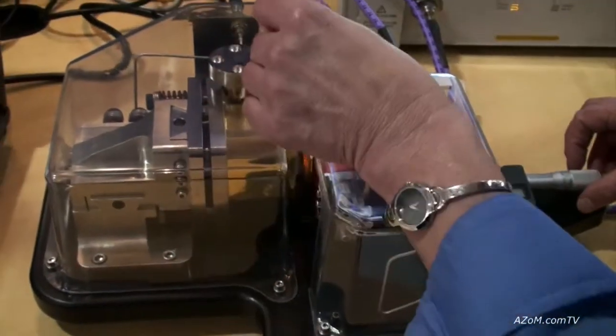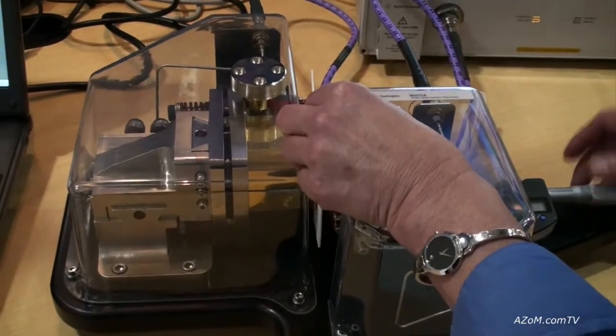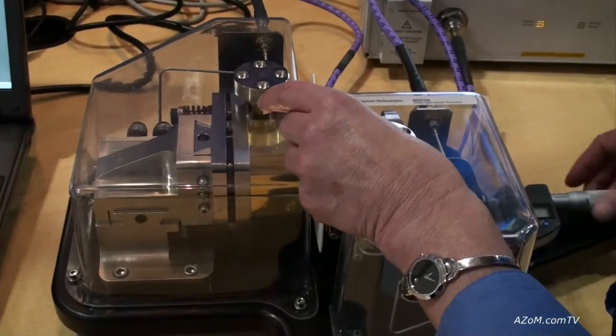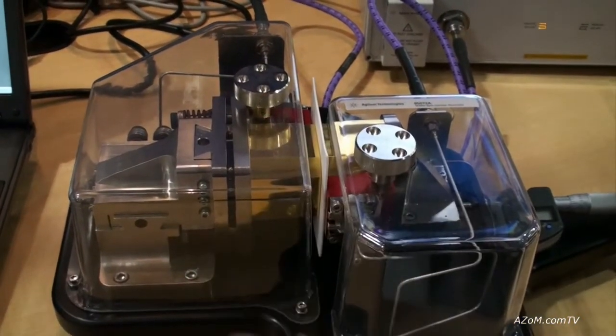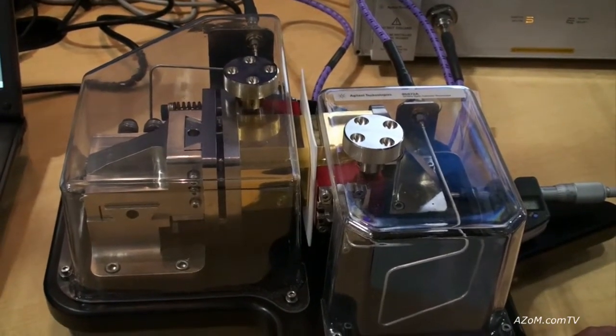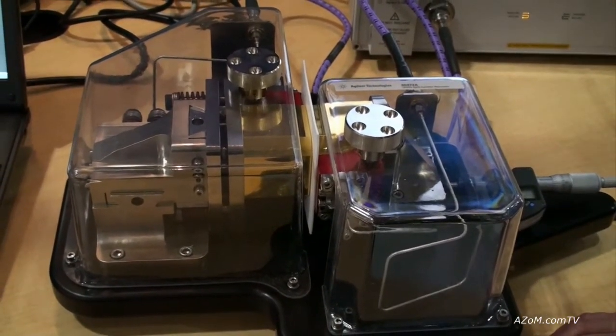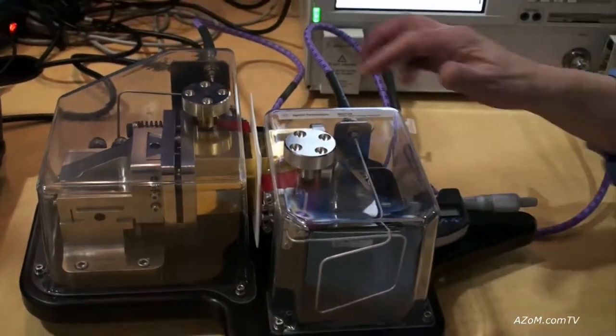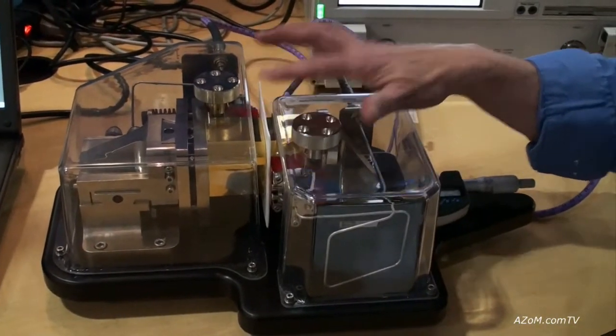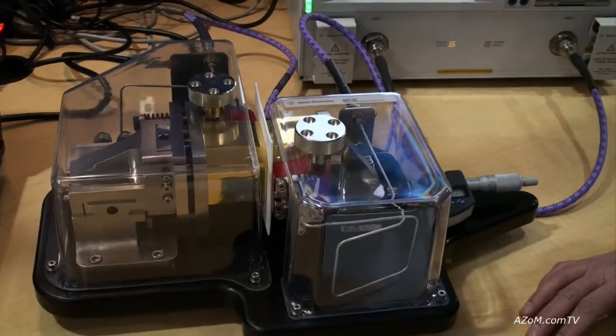The material is placed between the two cylinders and by measuring odd number TE0NP modes where the electric field is at its maximum, we can calculate permittivity.